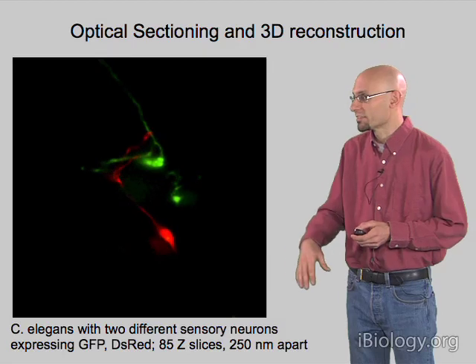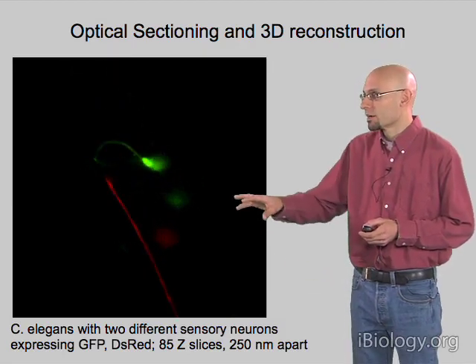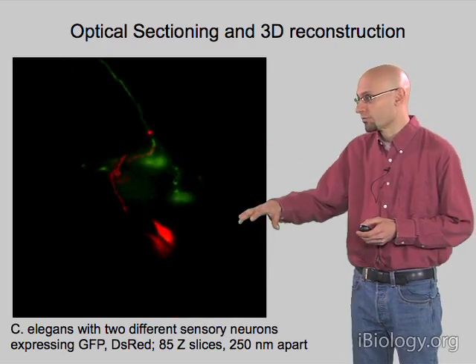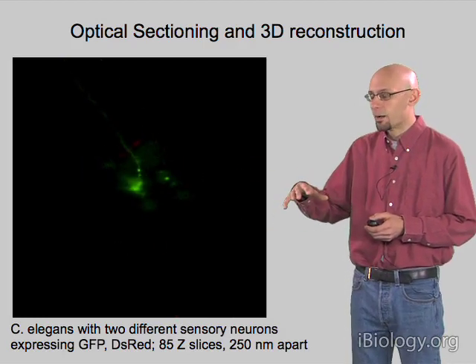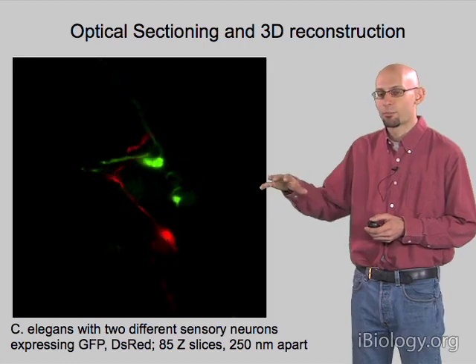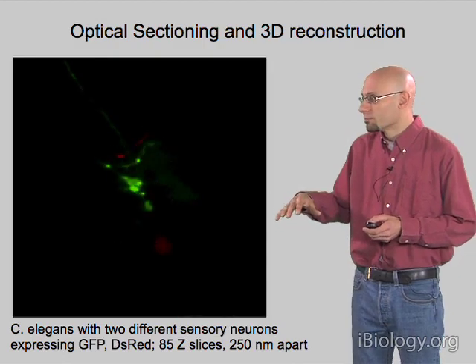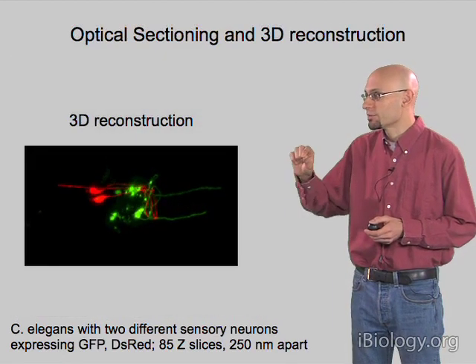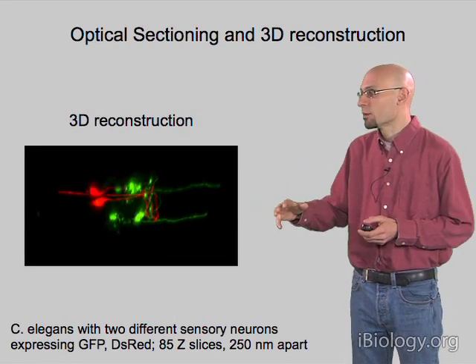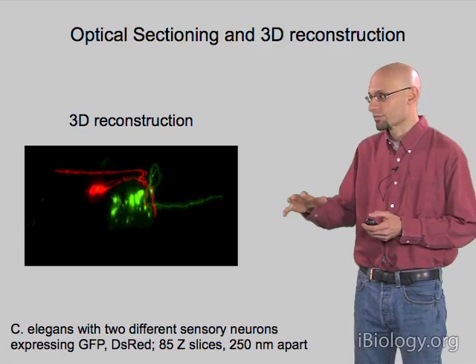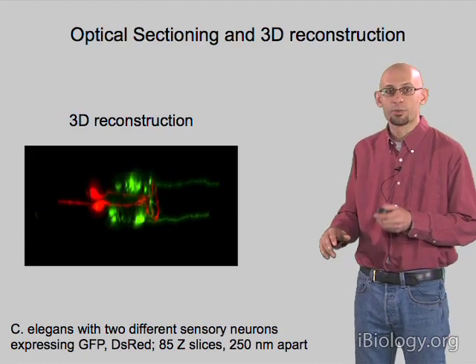Here's another example — this is a worm C. elegans expressing two different sensory neurons labeled in green and red. I'm showing here 85 Z-slices moving through the full thickness of the head of this worm. You can see there's a lot of information there, but it's hard to interpret what the connectivity of these neurons is just from the Z-slices alone. When we render those in 3D and compute views looking through different orientations, it's now much easier to appreciate what the geometry of these neurons is.